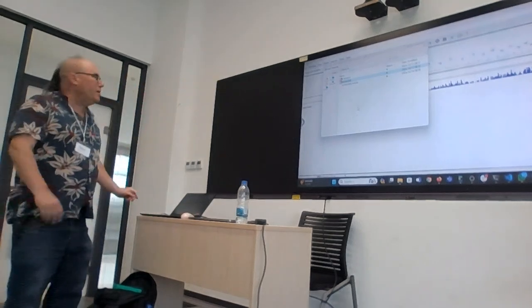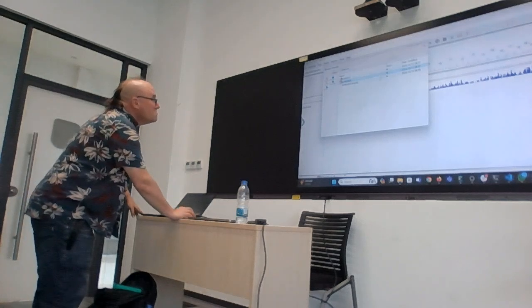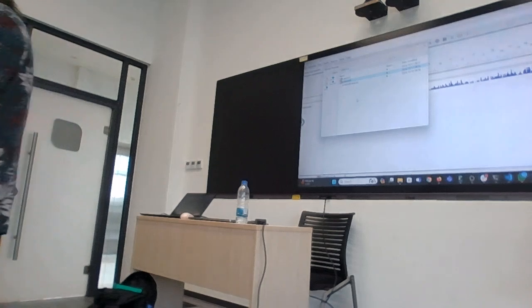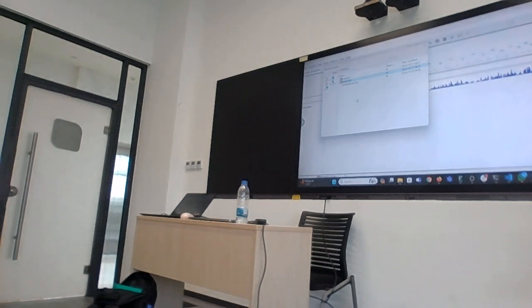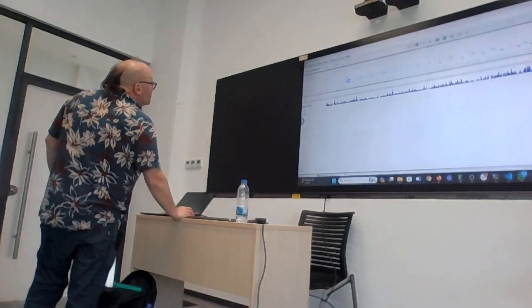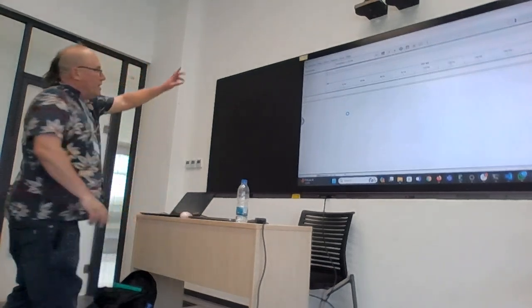MT903345. So you go to your unpacked folder with all of the mpox data. Then within it you find a folder called references. Within that you find MT903345. You find that file, and then you open it. And then it changes like that.